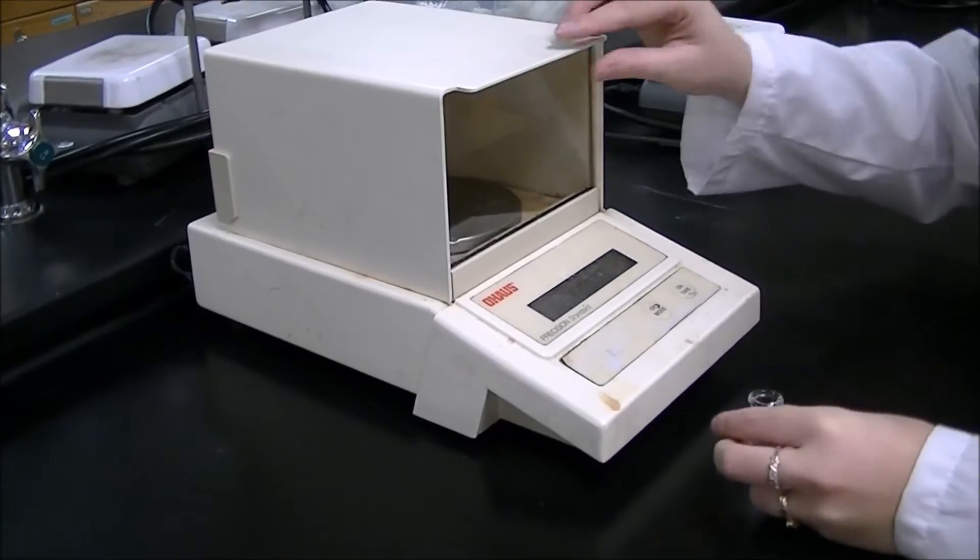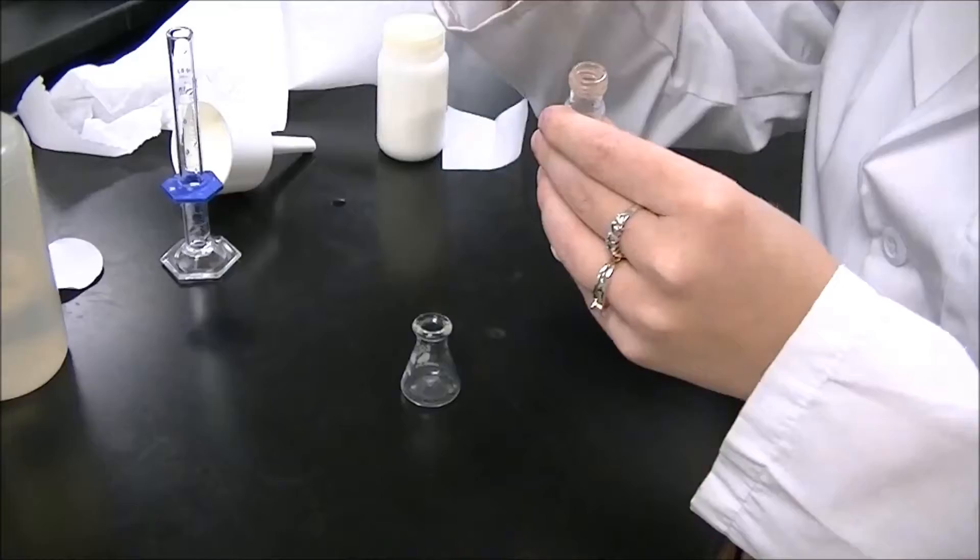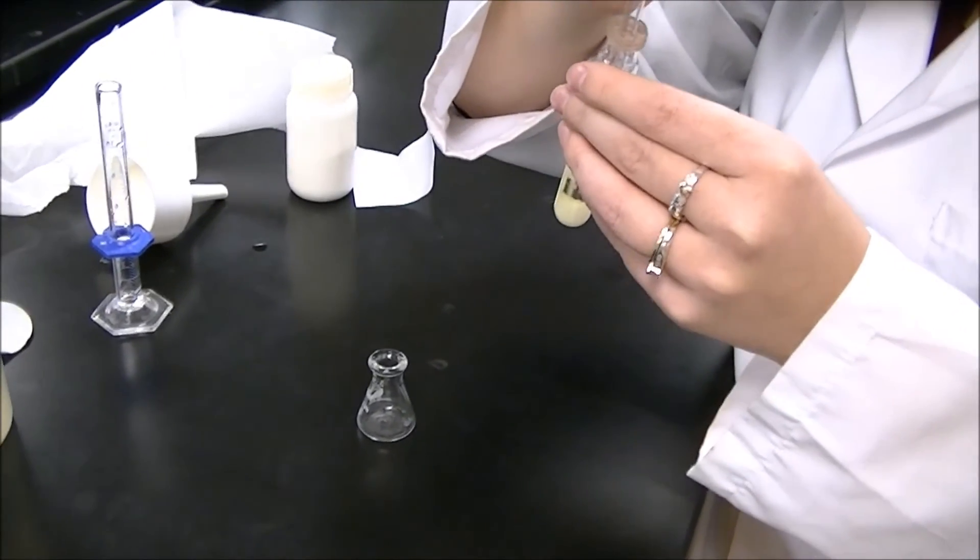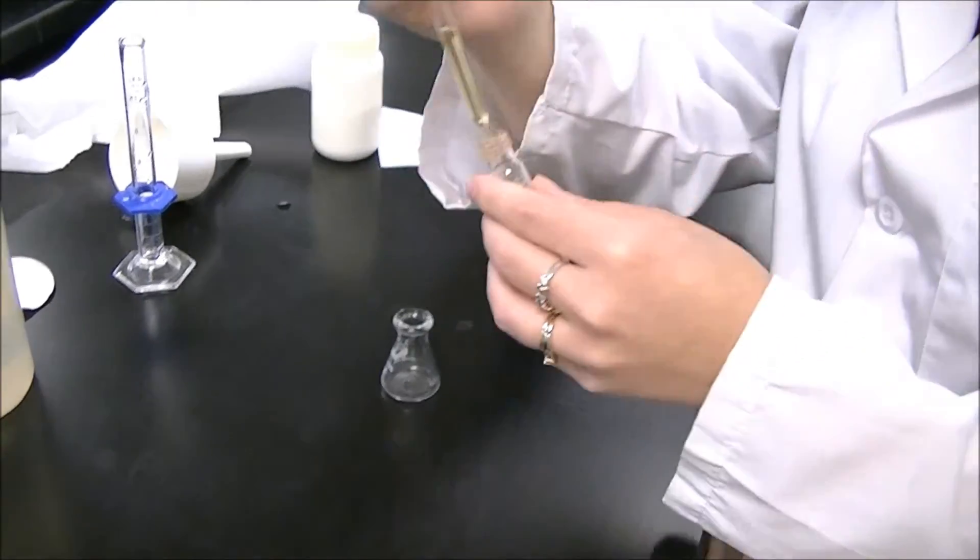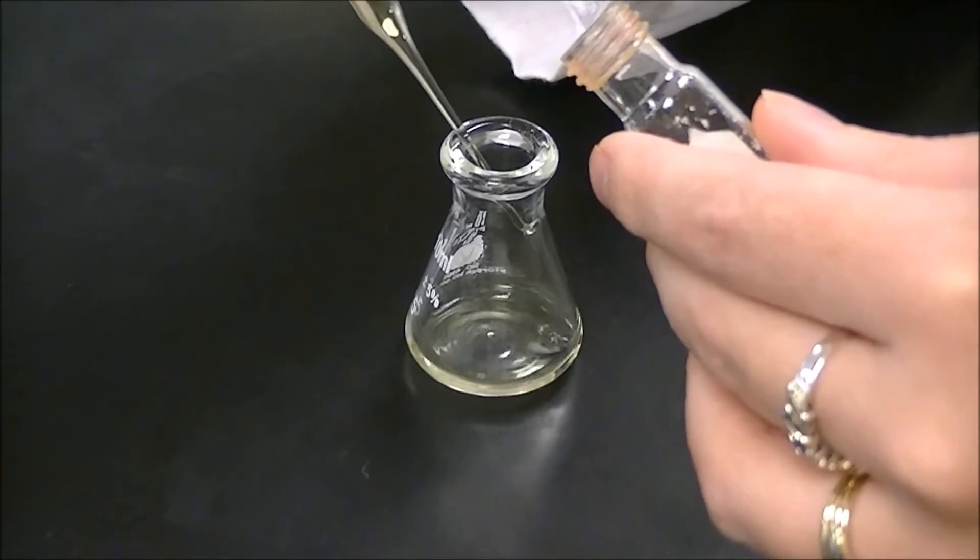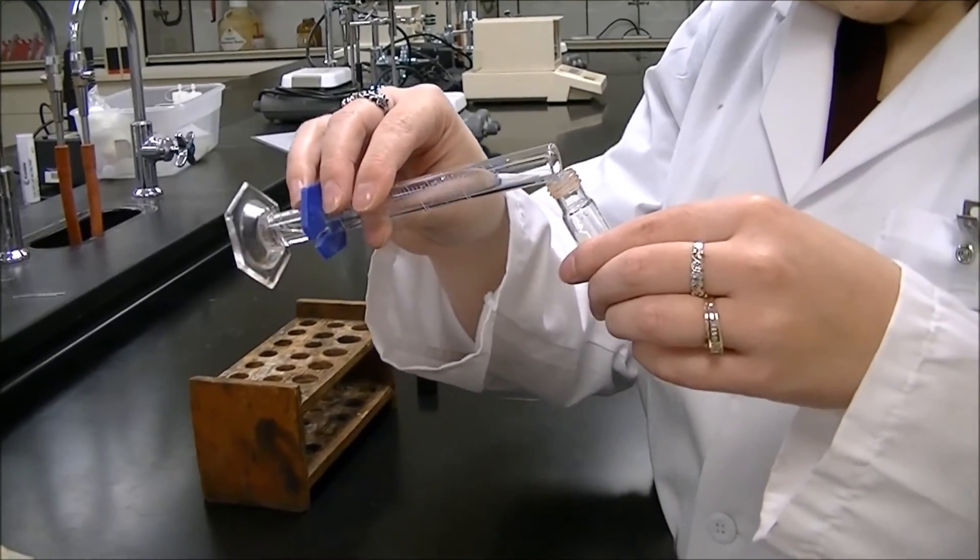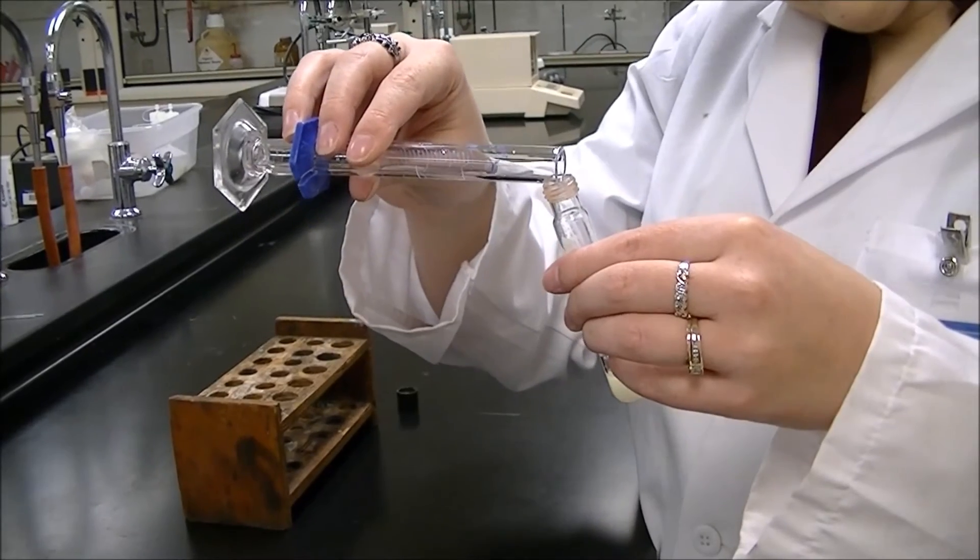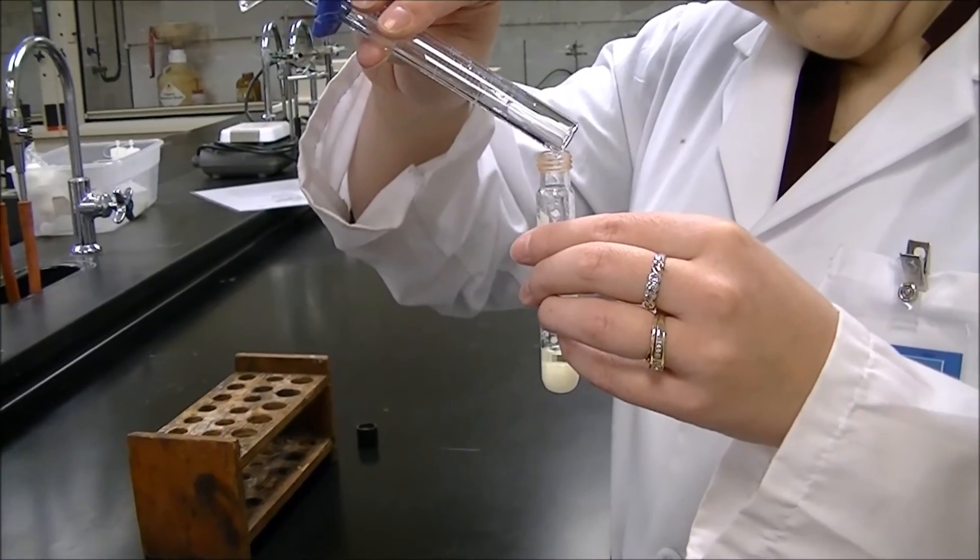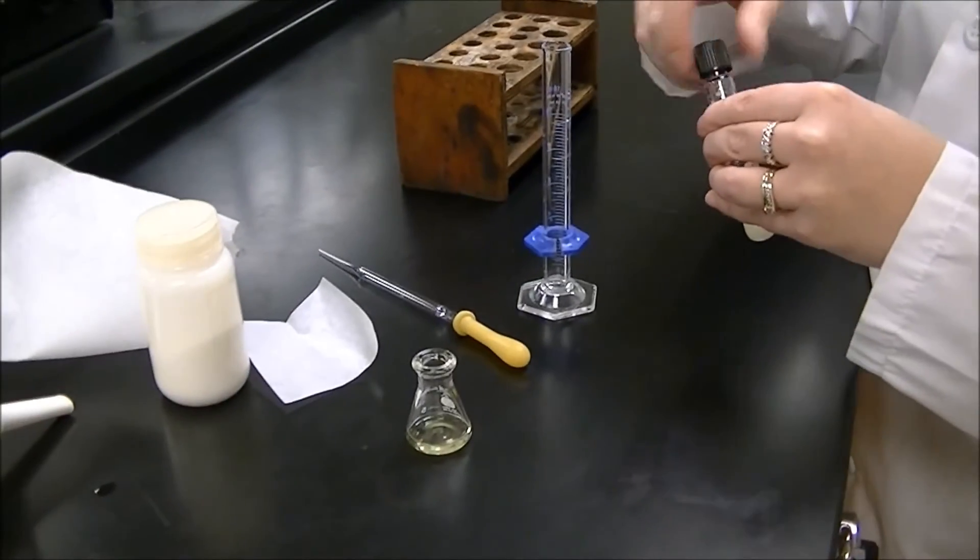Tare a 10-milliliter Erlenmeyer flask by recording its mass. With a boiling stone added, transfer your dry diethyl ether into your tared Erlenmeyer flask. Wash the sodium sulfate with 1 milliliter of diethyl ether, and then remove that diethyl ether and add it to the Erlenmeyer flask.